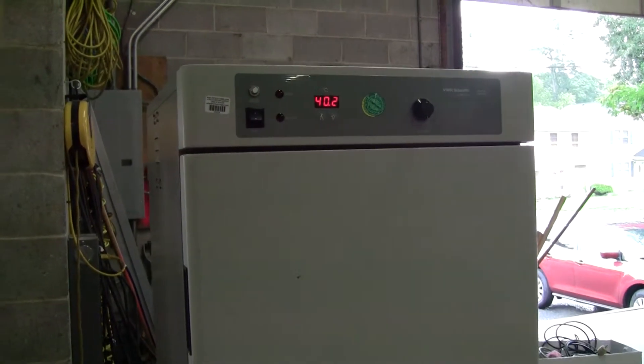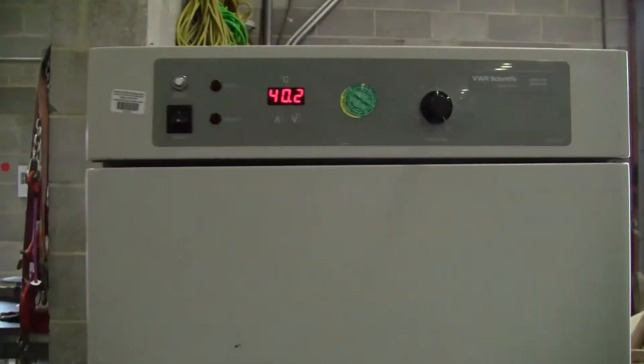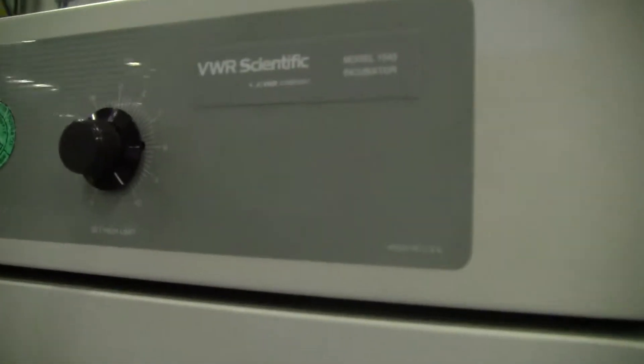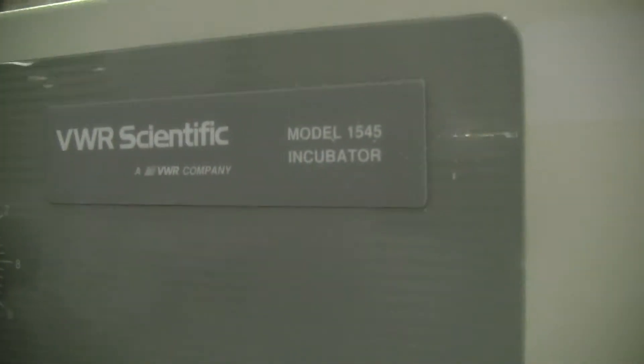Hi, this is Michael Natow from Hitech Trader. Today we're looking at a VWR incubator, model 1545.